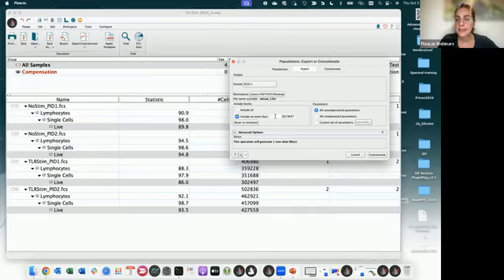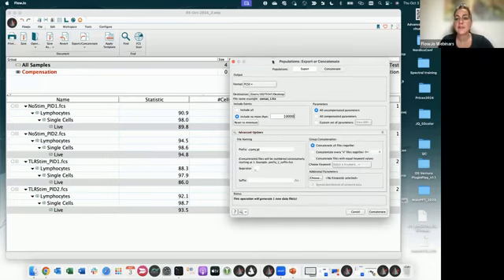And this is exactly the same thing of downsampling, and tell how many cells you want, how many random events you want to be picked up from each of these populations. So I can say, for example, 10,000, and I can then go on to my advanced options.